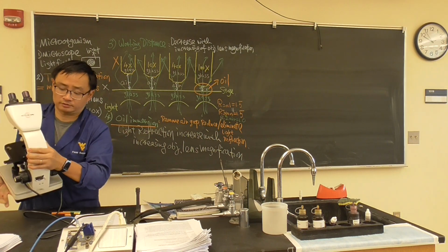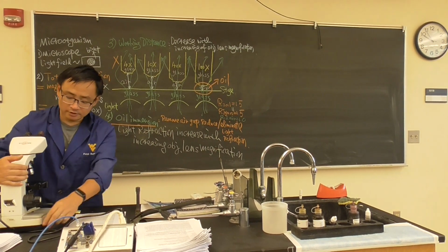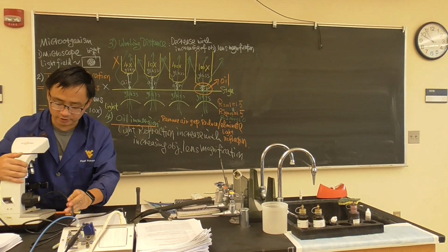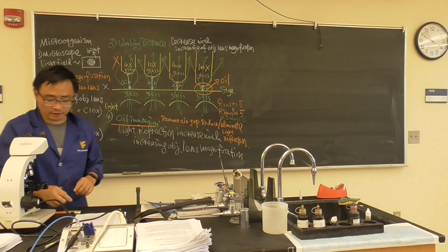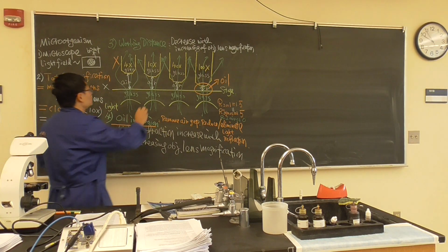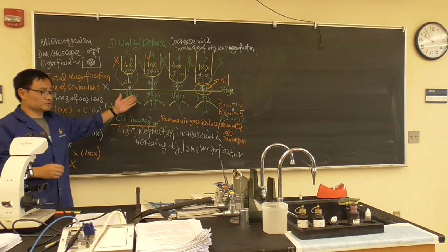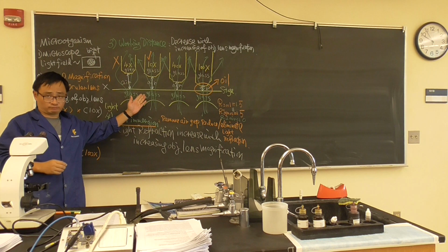We don't use it. If you are using a friend, a bench partner, who is doing that, tell him he may not have listened very well, so don't use that. We will stick to 10x to find the specimen, find your sample.